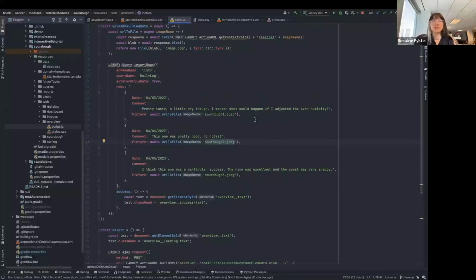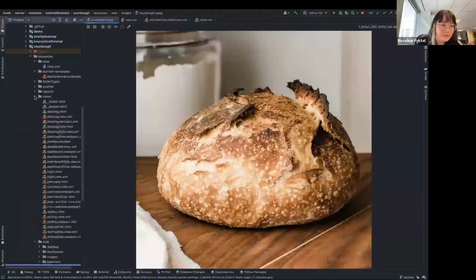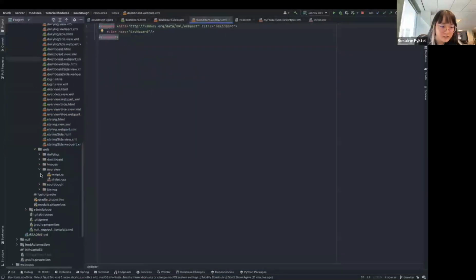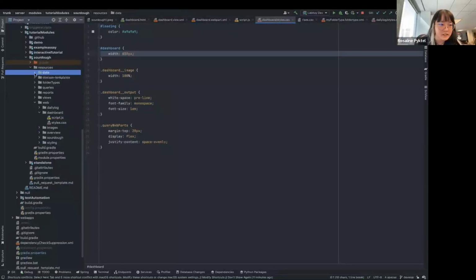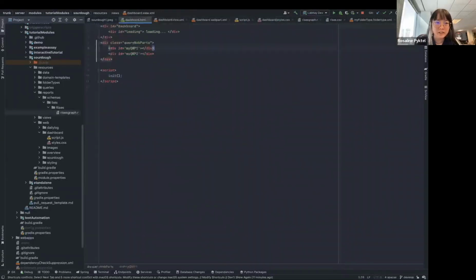So now we have covered data loads for queries and reports. What about the actual graphs and grids? So let me set up some files again. Dashboard. Alrighty. And one more. Cool. So tabbing over.